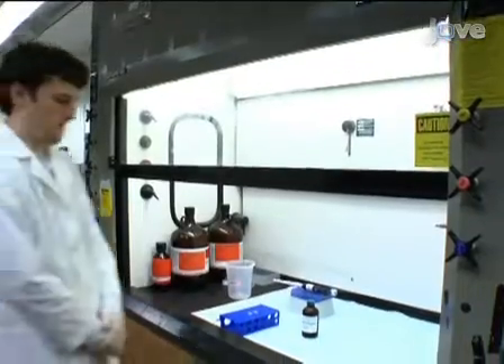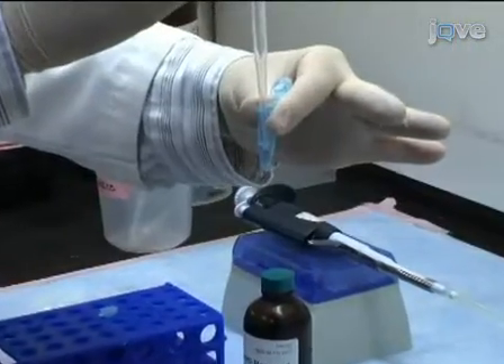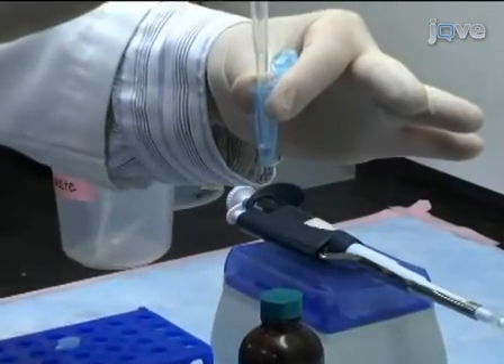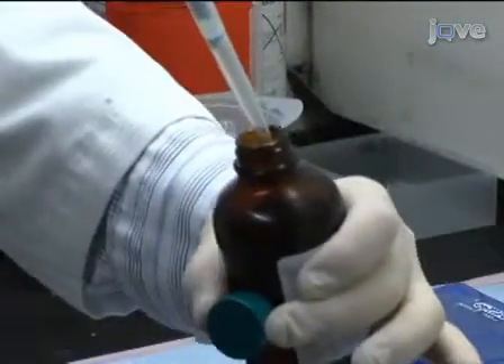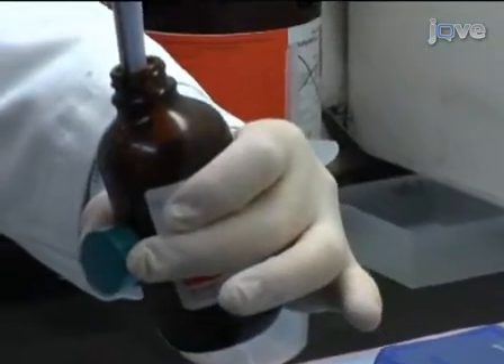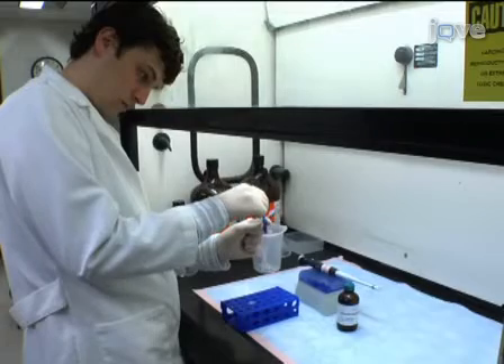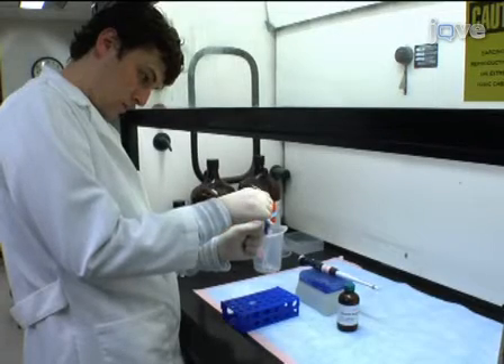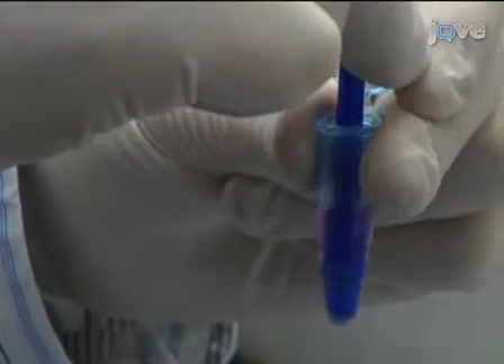To start the extraction, work in the fume hood and pool 50 zebrafish embryos in a 1.5 milliliter microfuge tube. Remove as much water as possible and immediately add 250 microliters of trizol reagent, which contains phenol. Use a pellet pestle to lyse and homogenize the embryos for approximately 20 strokes until the tissue is sufficiently disrupted.